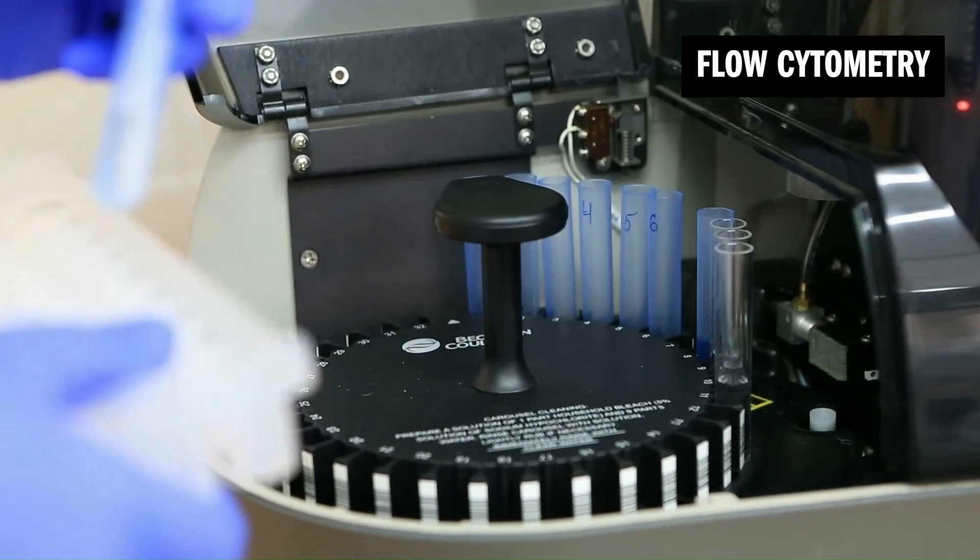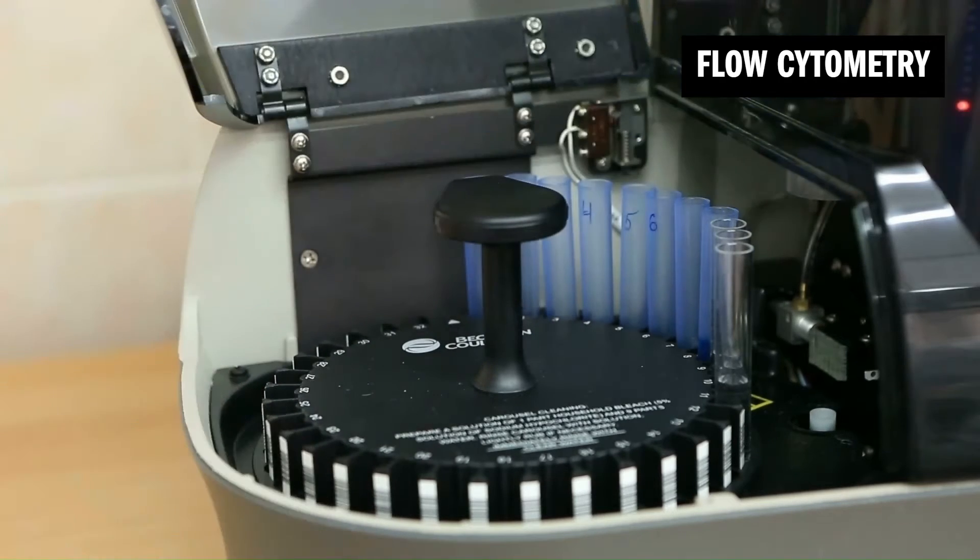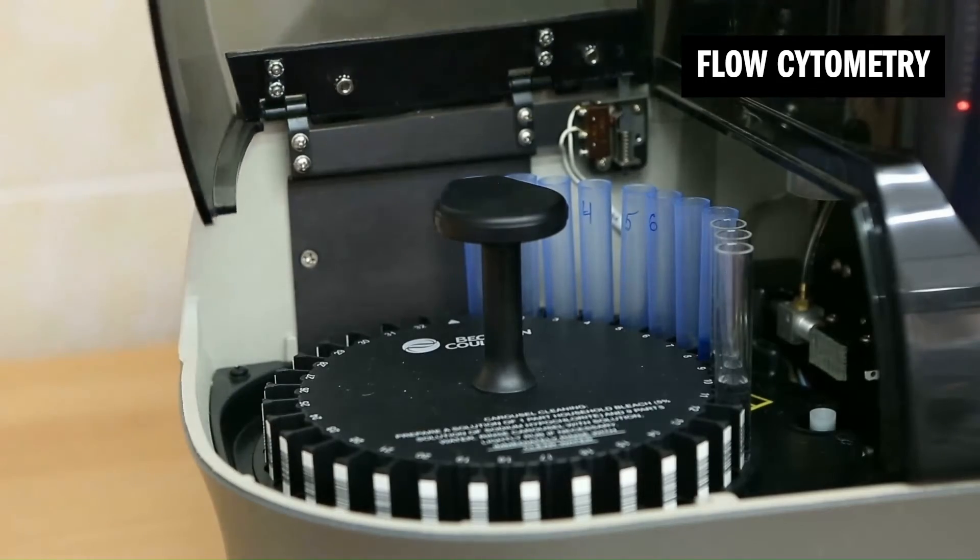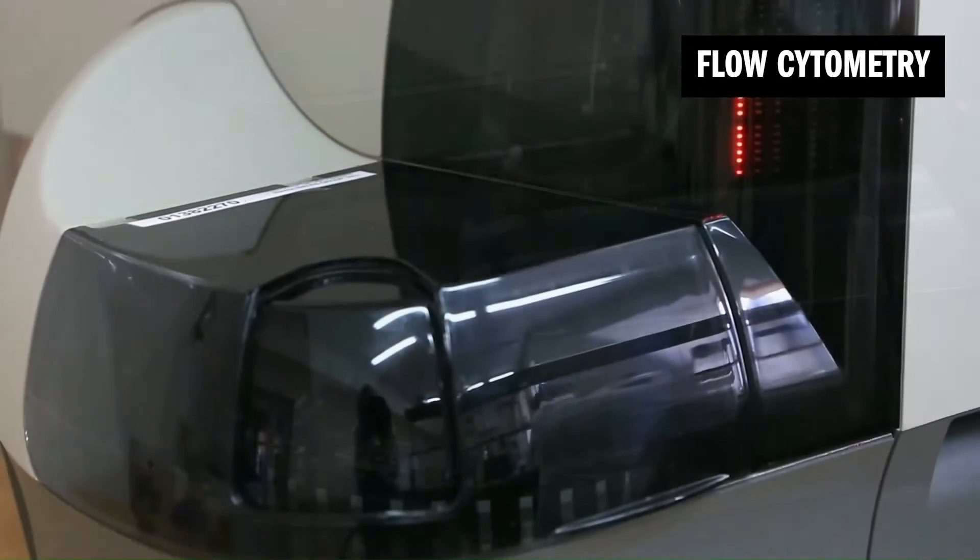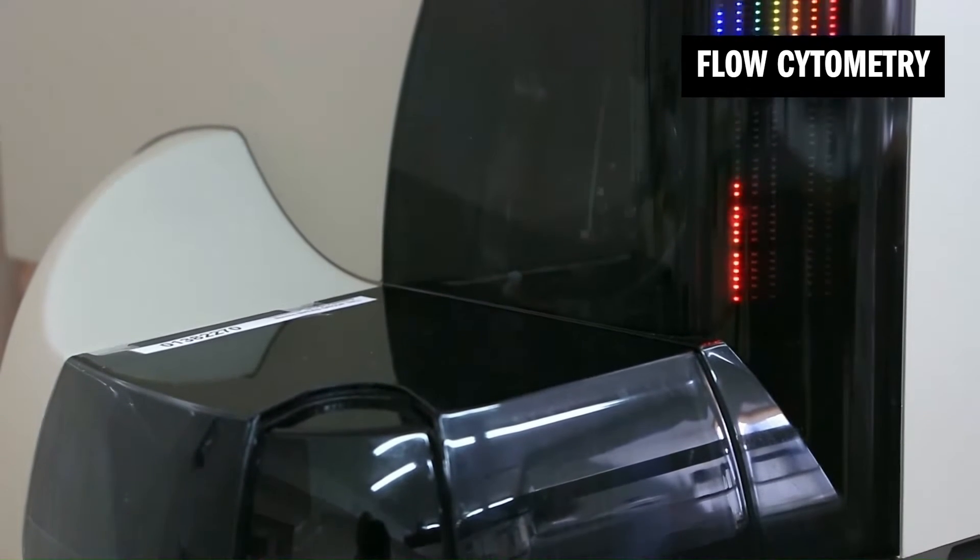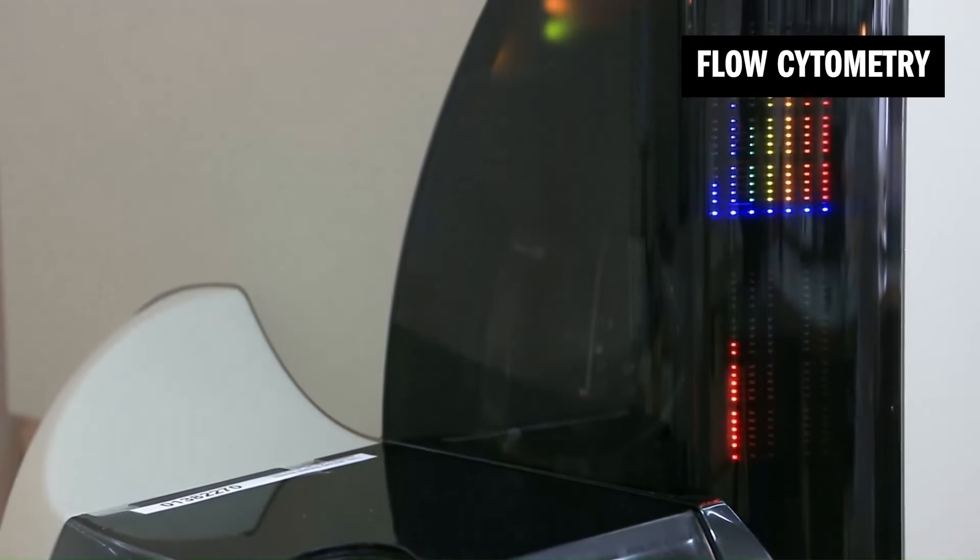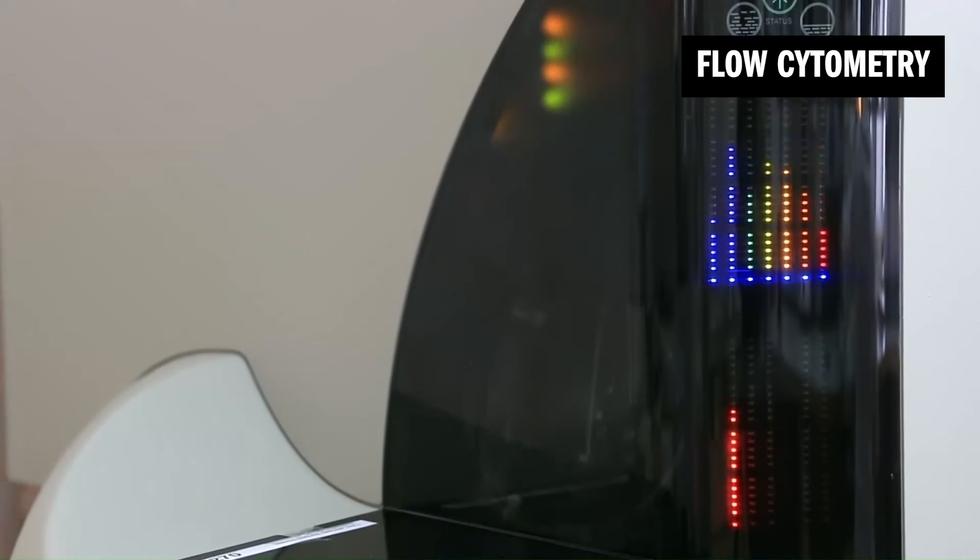Flow cytometry is used to examine the physical and chemical properties of cells and microparticles. Cells are typically suspended in a fluid stream, passing by a detector to reveal cellular information such as size, shape, and other detailed characteristics. Specialized cytometers can sort or even image the cells for further analysis.